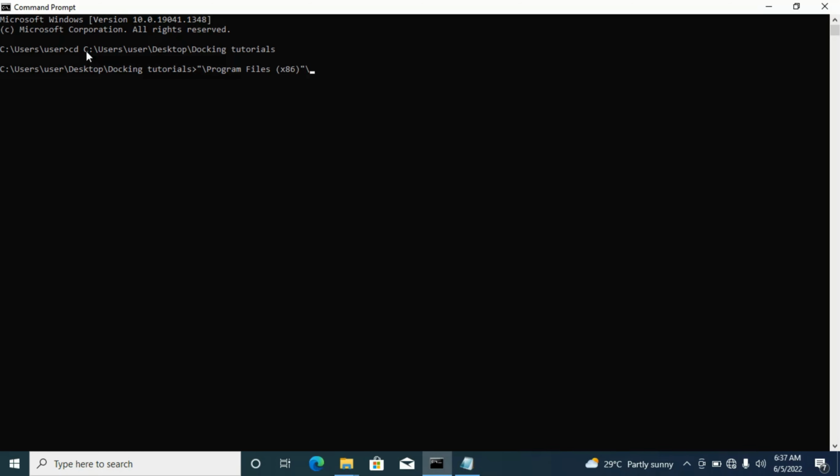Let me see what is inside it. So I will use my tab again. Remember, you just type a backslash and use the same tab again. You'll be looking for your folder. As you can see, mine is going through. The Scripps Research Institute is the folder I'm looking for inside this program file. I've got that.